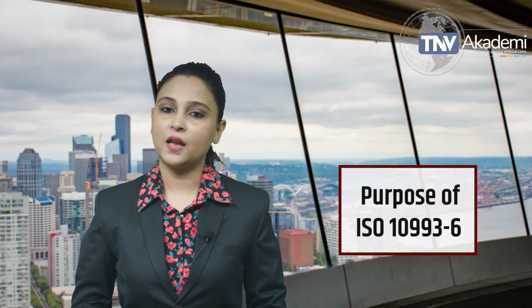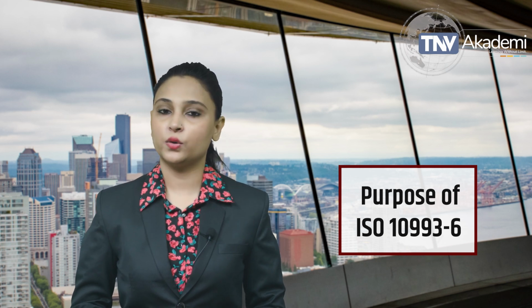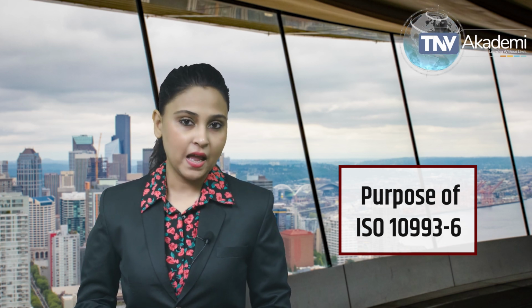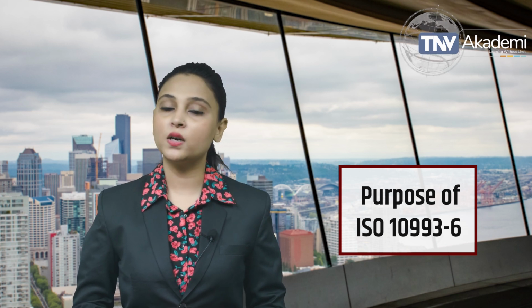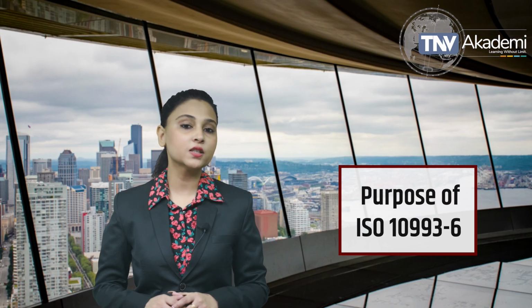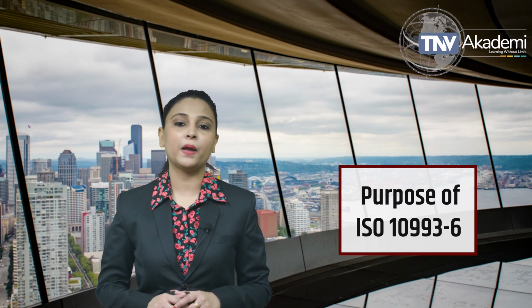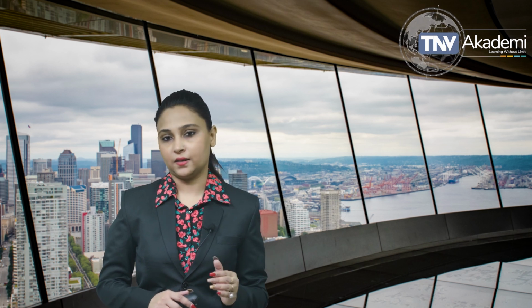Purpose of ISO 10993-6. ISO 10993-6 specifies procedures to assess tissue reactions around or near the implant site, helping to detect any signs of inflammation, toxicity, or adverse cellular reaction. This testing is especially critical for long-term implants, such as orthopedic implants, cardiovascular devices, and other materials that remain in the body over time.